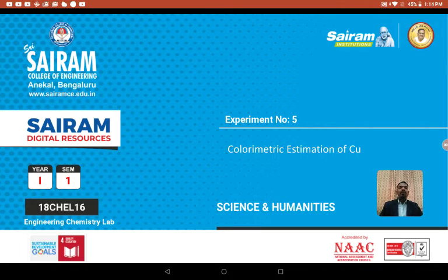Already you have seen how to find out the amount of substance present in a compound by measuring its potential, and by measuring conductance of the reaction. Today we will see how to determine the amount of substance present by measuring its color.